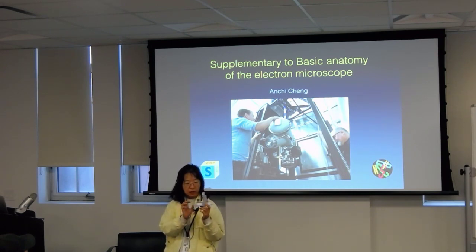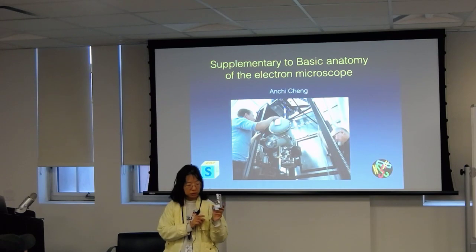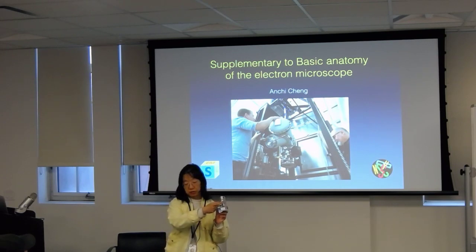Okay, this kind of microscope is actually best for investigating the different components because you can see them right away. So this little model here has a place to put the specimen holder, put the specimen in. Any part on top of that, if you have a lens there, if there is an aperture there, those are for the condenser system.